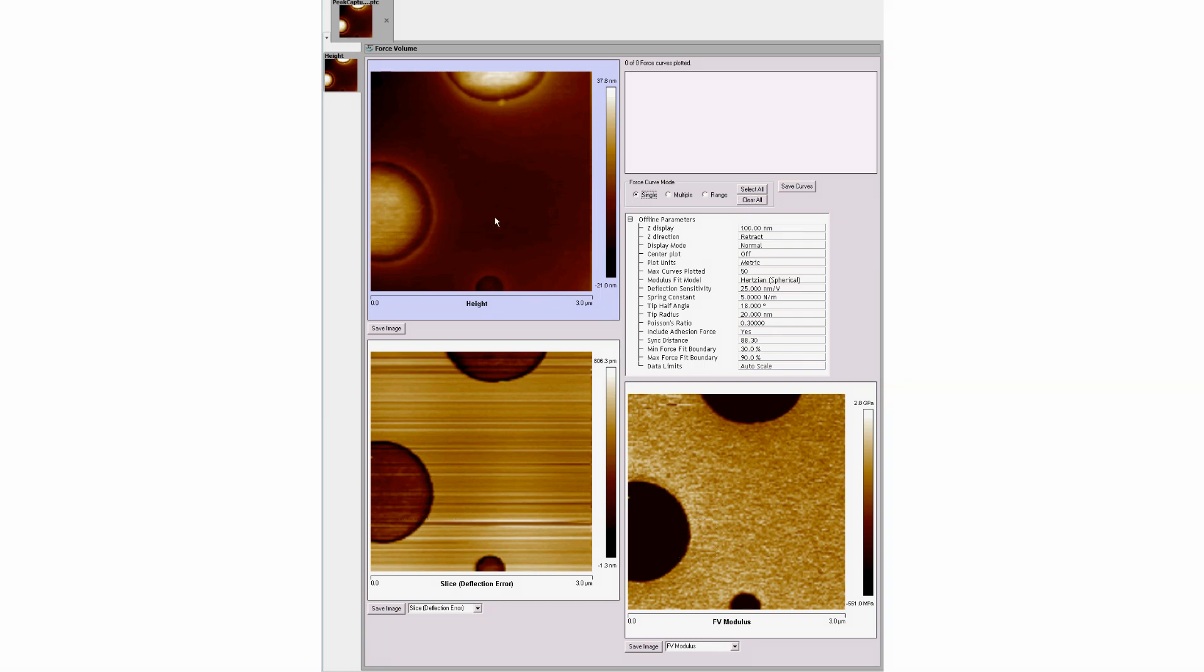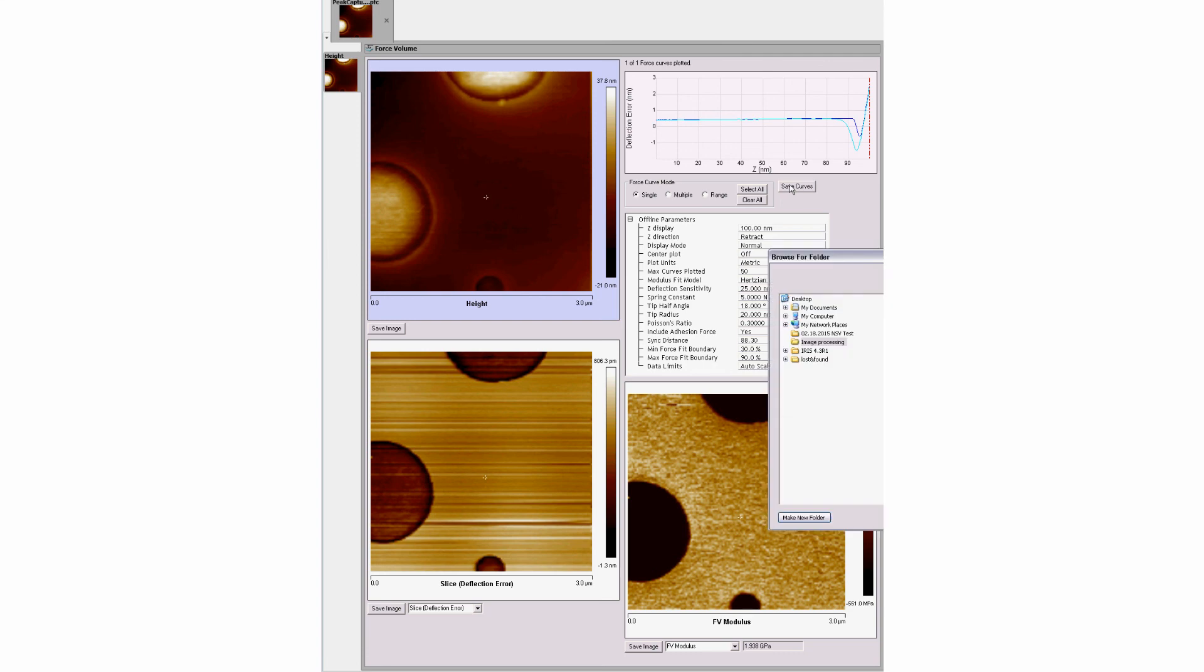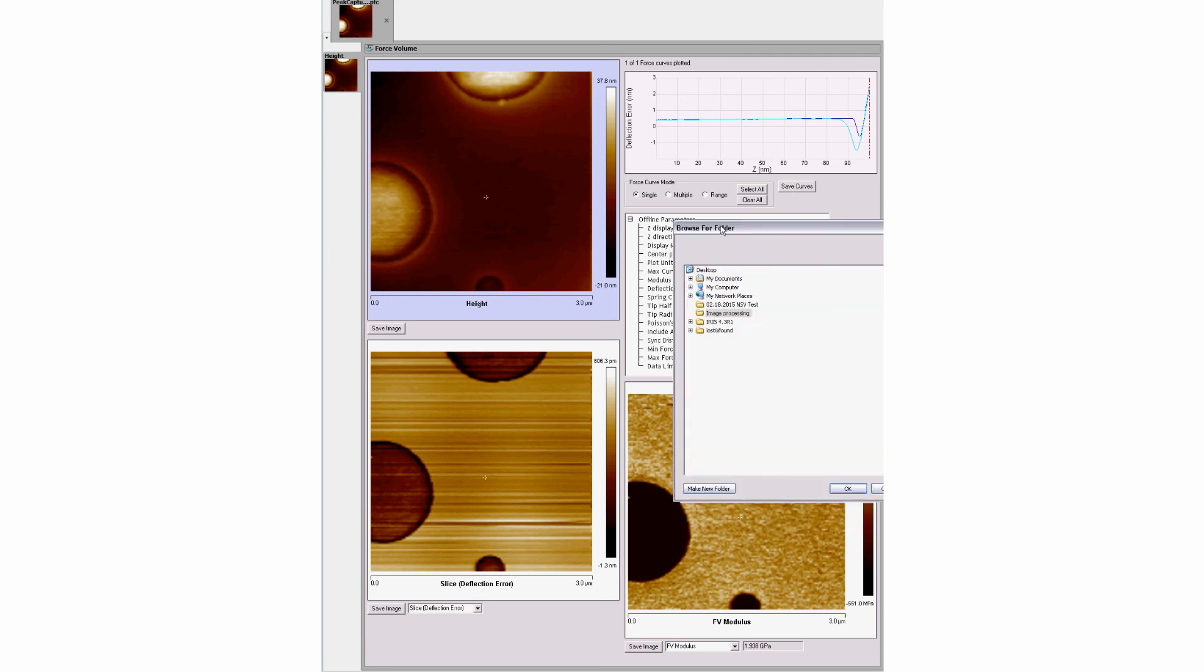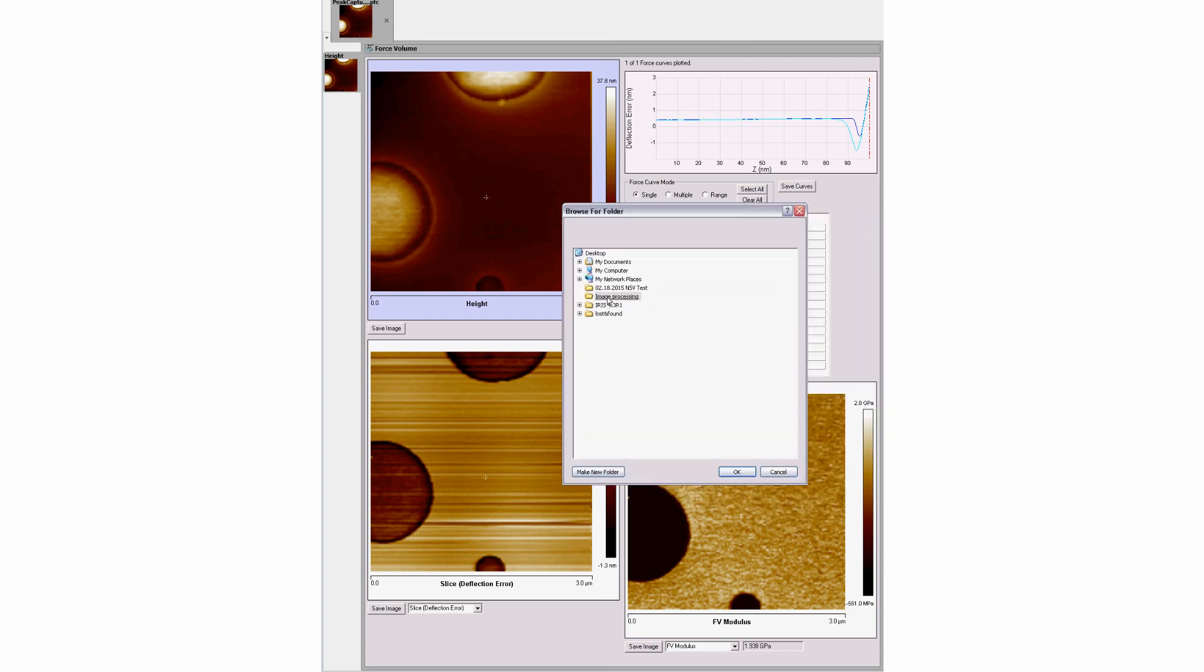To export force data to an individual file, use the Save Curve button to select the destination.